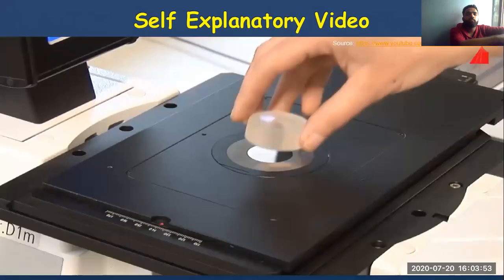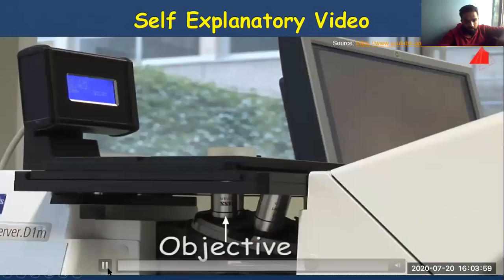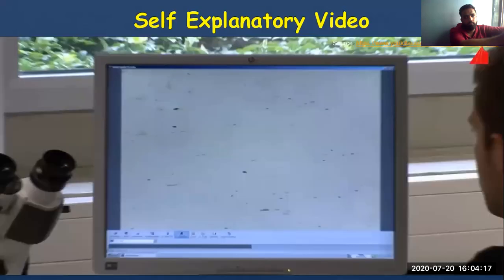In fact, the design of typical metallographic microscopes is inverted. Inverted means upside down. The microscope objective is not facing downwards as usual, but upwards. This offers the advantage of simply placing the metallographic specimen on top of the microscope stage. The prepared surface faces downwards. Using the built-in digital camera, the polished specimen surface can be observed on the computer monitor.